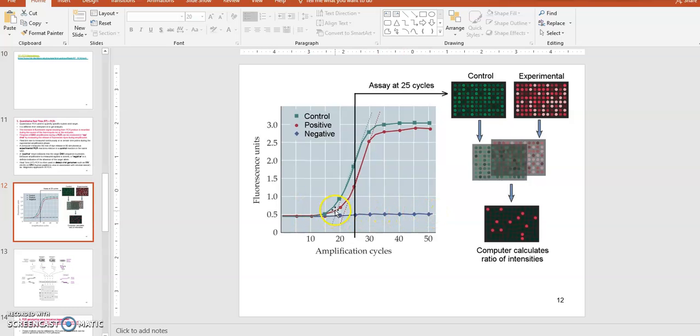And the positive PCR may be the control, where you know the amount of certain template DNA that's added. So that's the positive control, if you will, and that's the negative control, with no template DNA added. Certain amount of template DNA added, and then in between you will do a measurement using the sample.